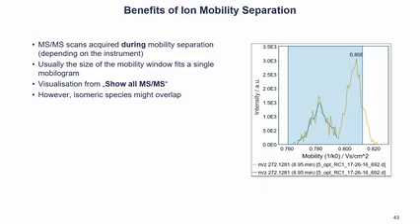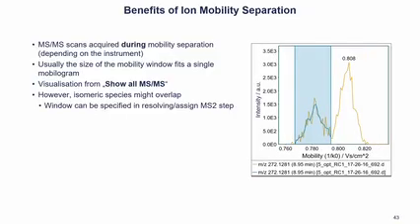And now in MZmine, you can actually tell MZmine to select the MSMS spectra that were collected in the right time. So you can actually do something like this, where you fit the MSMS assignment window to the peak in the mobility dimension. So you only get MSMS signals from that one isomer.